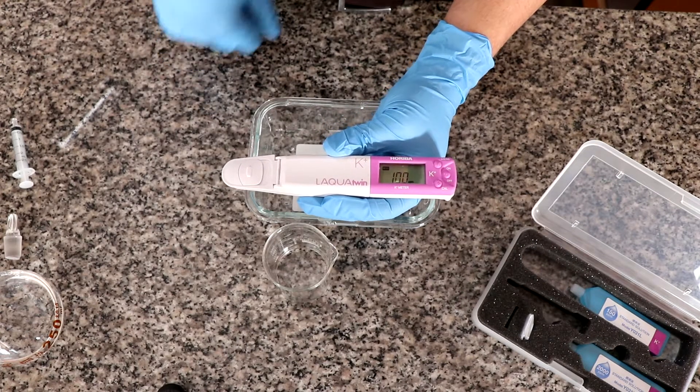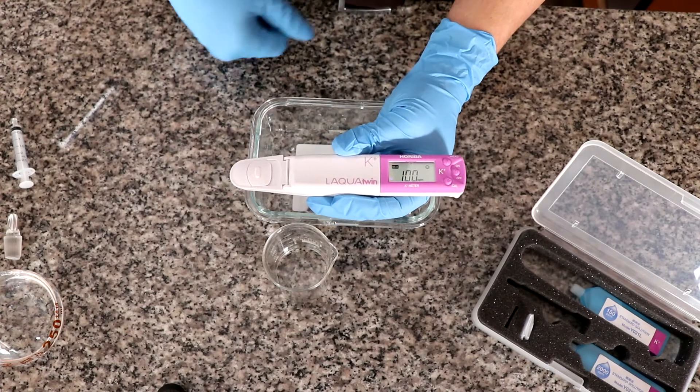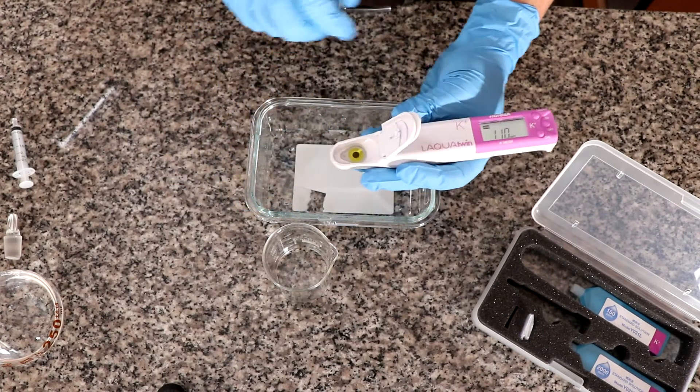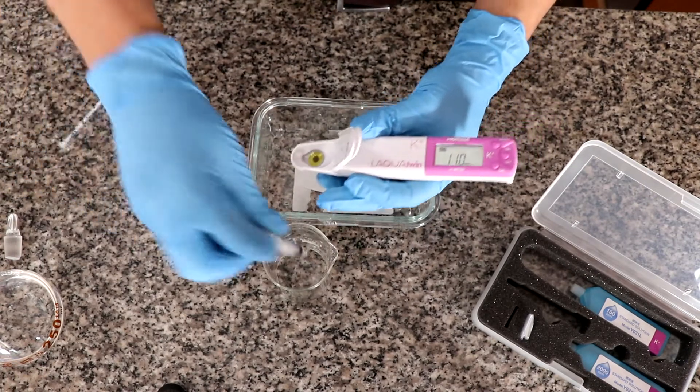So it is stabilizing. We don't have any happy face yet. And there we go. We have 100 ppm again. So this is showing to be pretty stable.